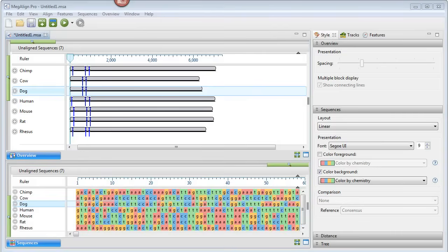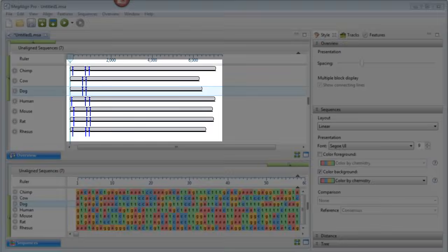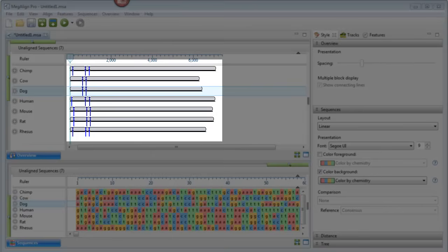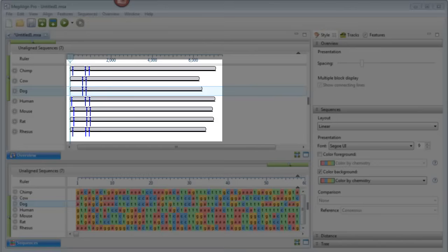In the overview, observe that each species is represented by multiple gray blocks of different lengths. Blue dividers show where one segment ends and another begins.